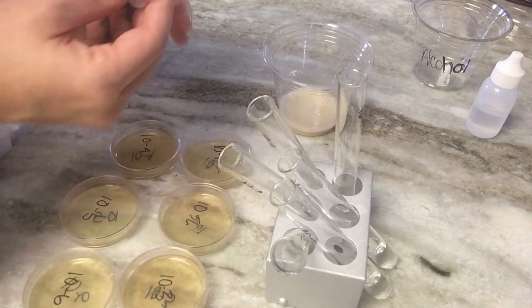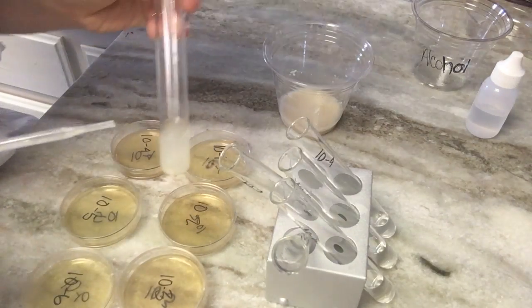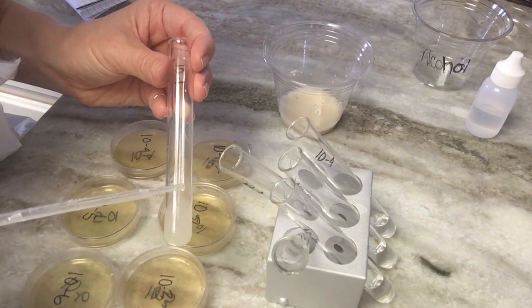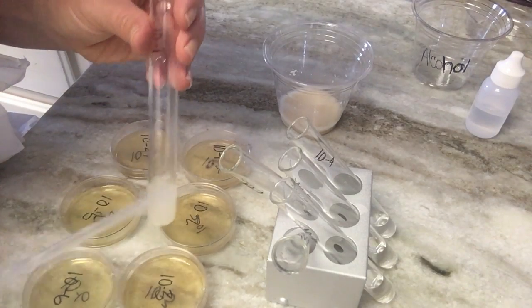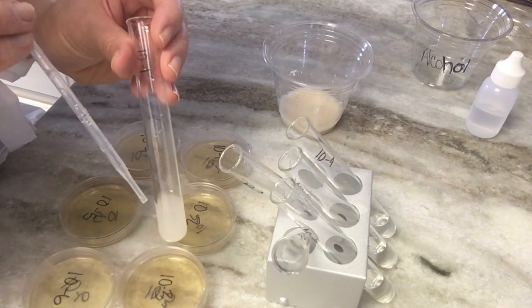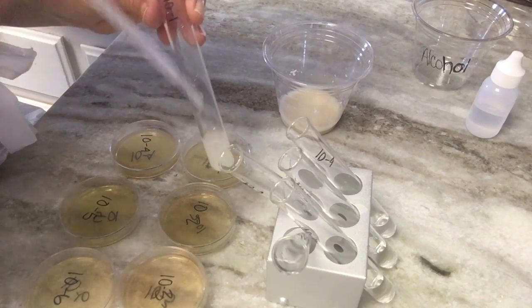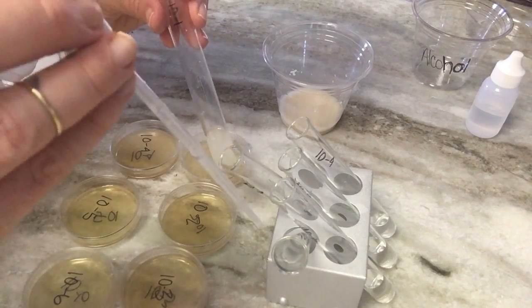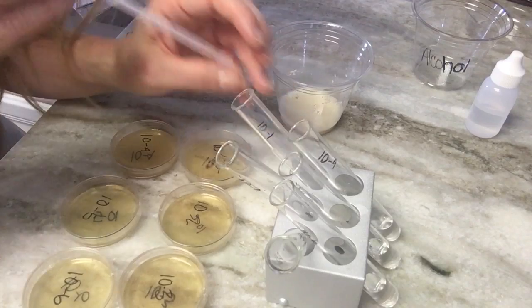So what we do now is, 10-1 of our test tube. You can see it's a little cloudy. It has 0.25 milliliters in it. And after I pipetted it out really well, then I took another 0.25 milliliters and put it in 10-2. Washed it out really well and took 0.25 milliliters into 10-3. So the point is, just like the name of our lab, things are becoming more and more diluted.